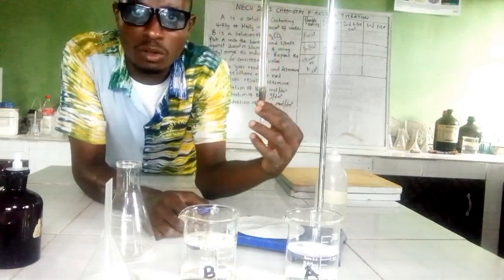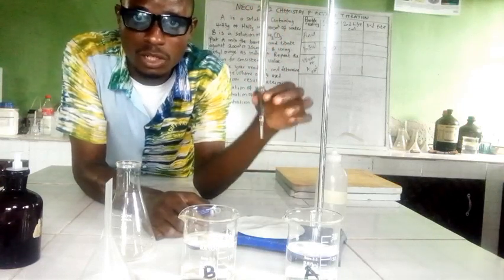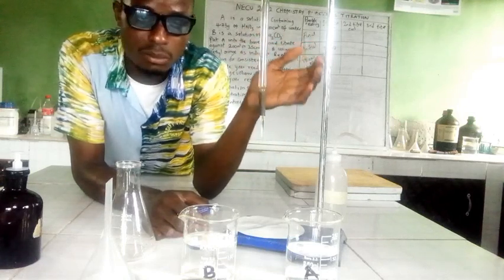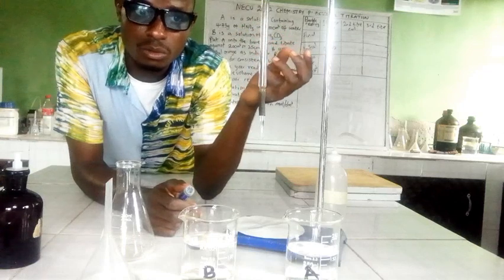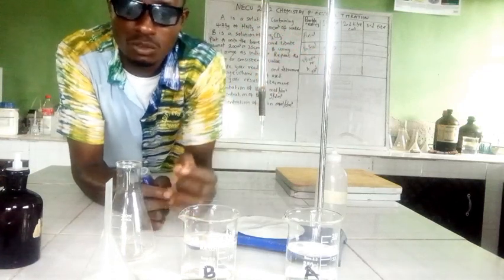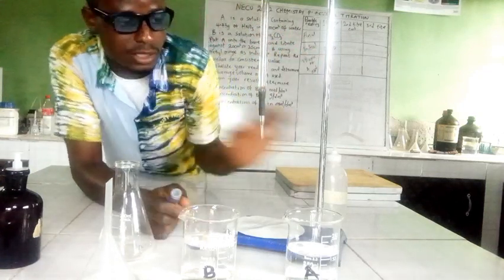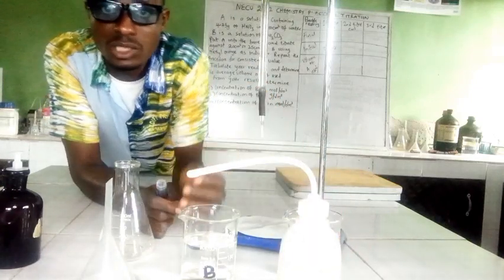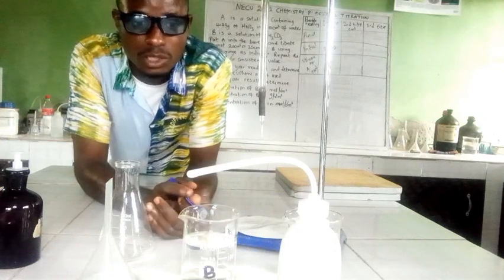And mind you, you cannot find a pin here because I actually use a ball bearing. So the ball bearing is also an alternative to the pin, because those pins get rust. So let's move on. And this is the distilled water, in case you are meant to rinse any of these glasswares you're using.